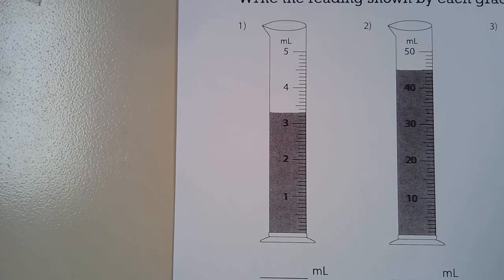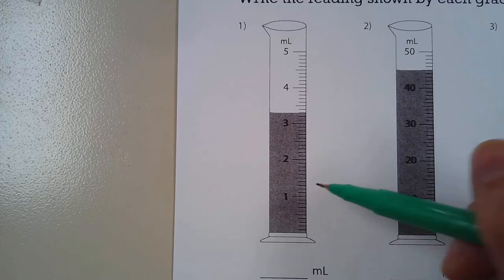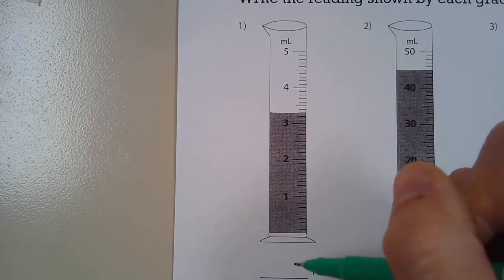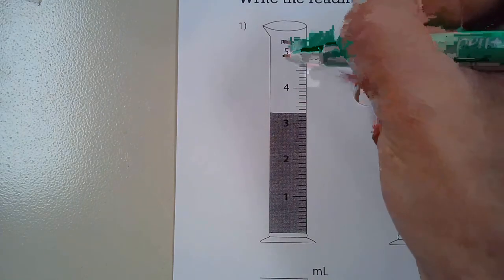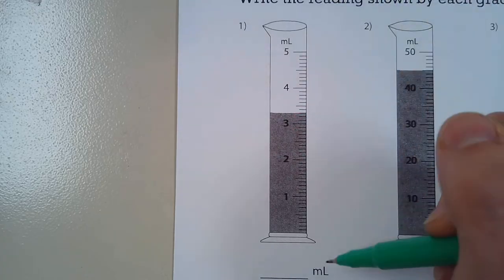What that means is what are those littlest lines counting by. The bottom is always zero milliliters and this tells us how much volume the liquid holds. This particular one only holds five milliliters, so your answer will never be above five for this graduated cylinder.